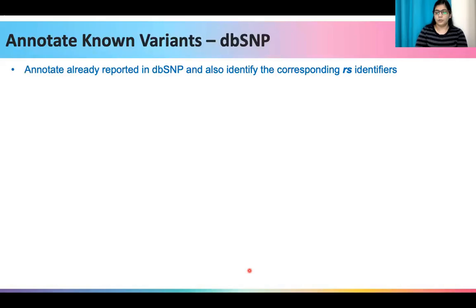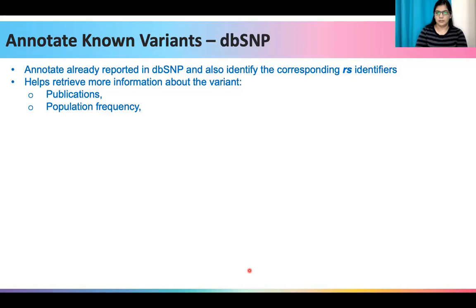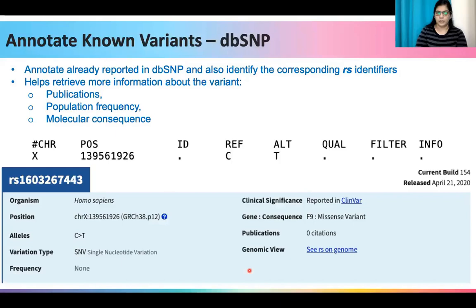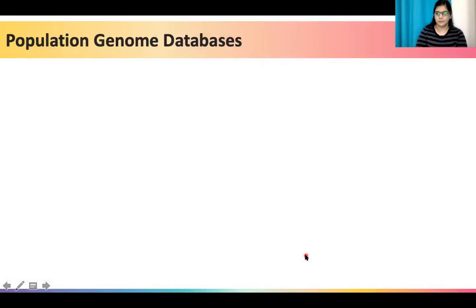Annotation of known variants, such as those reported in dbSNP, and finding the corresponding RSID associated with the variant can help uncover additional information already reported in the dbSNP database — such as the publications that cite the variant, the population frequencies, and its molecular consequence. For example, the previous variant shown in VCF format has a corresponding RSID, and viewing this RSID on the dbSNP database tells us additional information such as the gene in which it lies — the F9 gene — the molecular consequence that it is a missense or non-synonymous variant, and the number of publications associated with this variant.